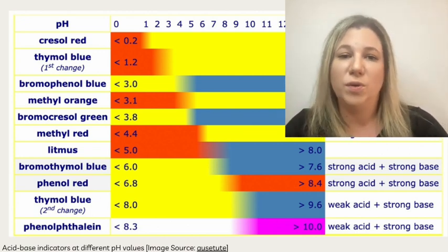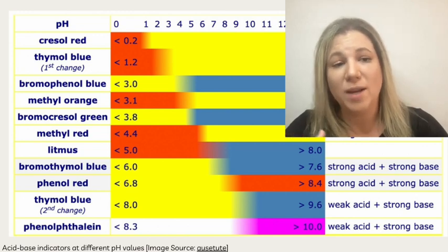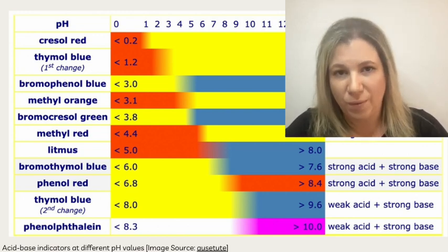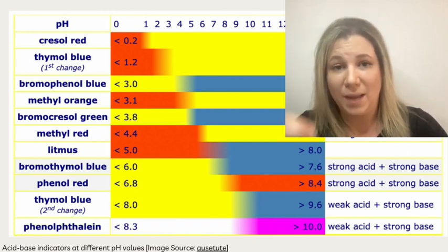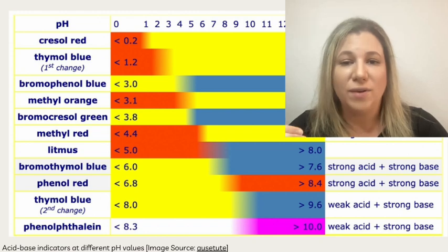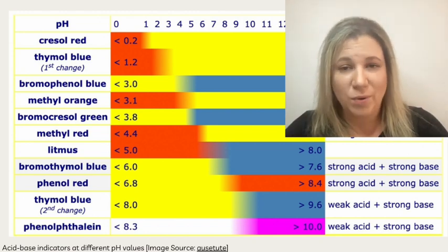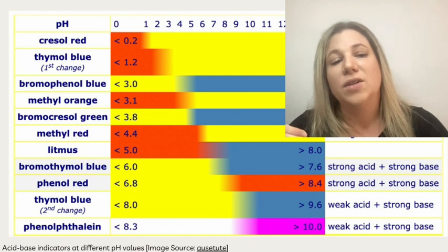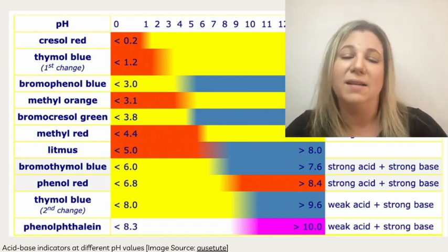So the way that you would measure a weak acid and a weak base to find the endpoint would be using a pH probe. When you're doing the titration, you can just have the pH probe in with your analyte, and as you are titrating, depending on what type of pH probe you use, the new ones will basically graph it for you.